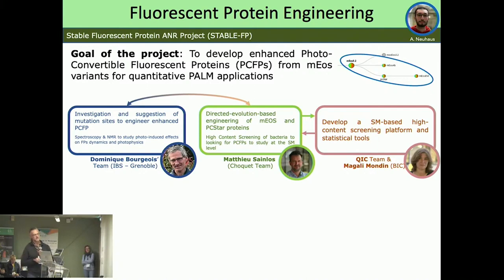Now, I think it's really fantastic, you know his work. He is deeply characterizing what today prevents us from doing some quantitative analysis, from what we were expecting at the beginning of the method, to be able to do some molecular counting, some better tracking, and so on and so forth. So there are a bunch of tools to characterize all these dark effects, how to improve the signal, but also what is toxic in there and how we can improve that.